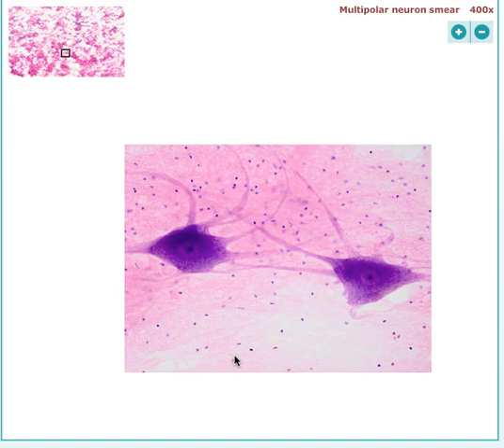They provide insulation, protection for the neurons, and there are many, many different types of glial cells, and the glial cells are the support cells, or the most abundant cell of the central nervous system.